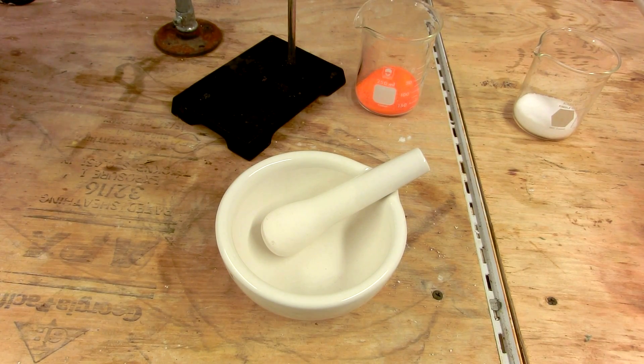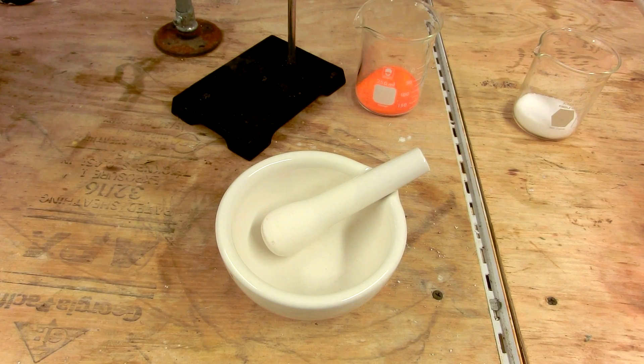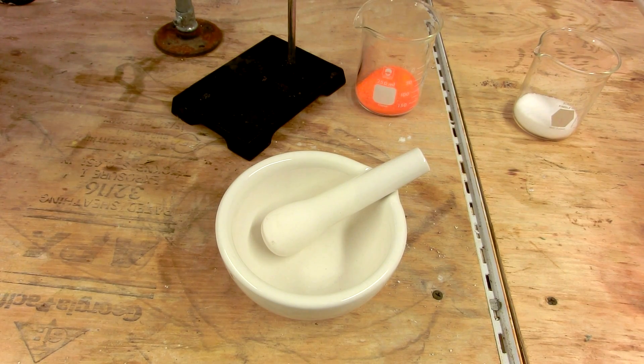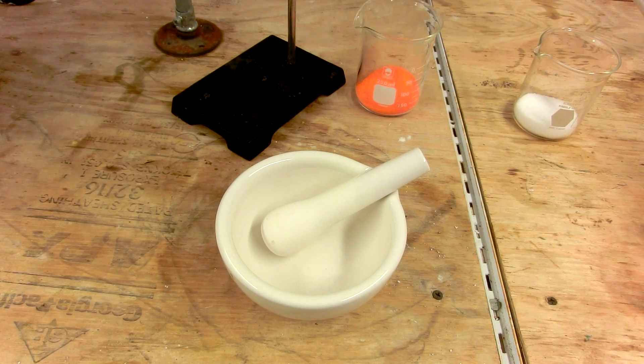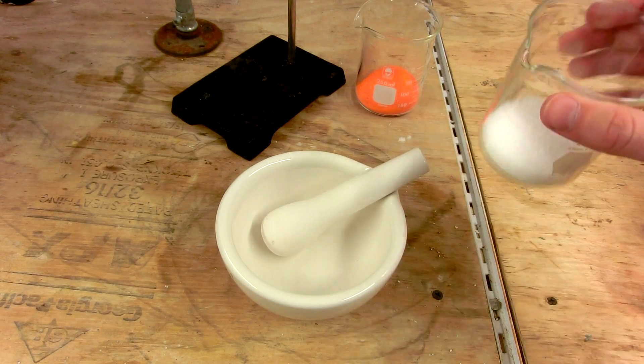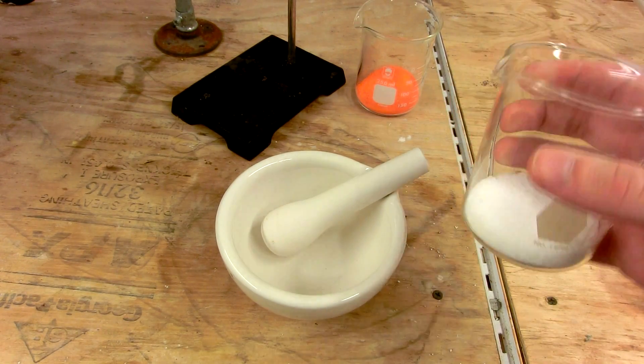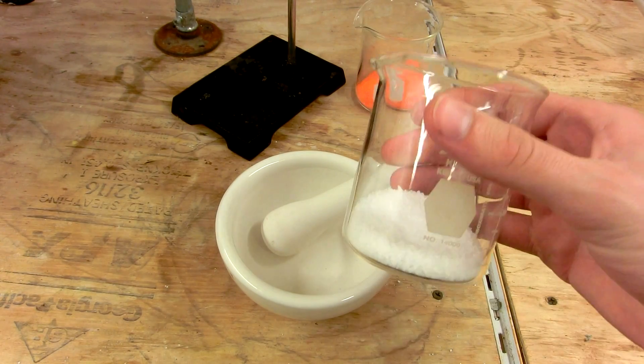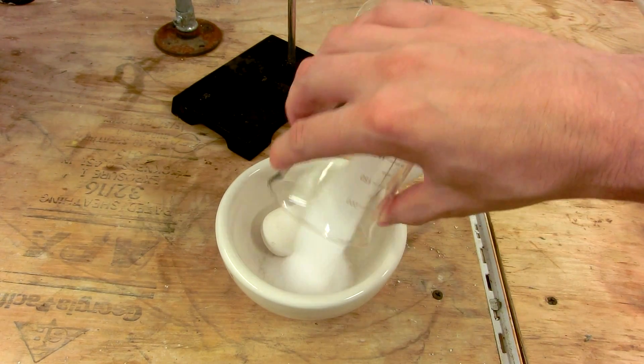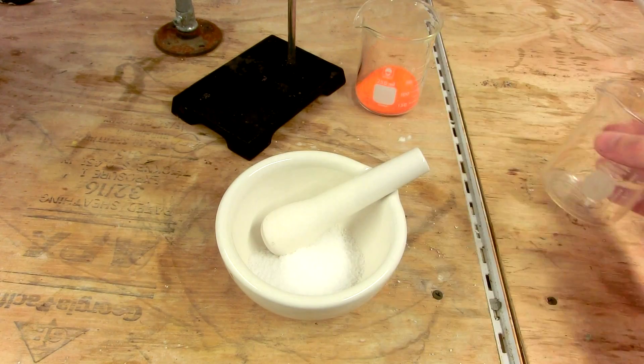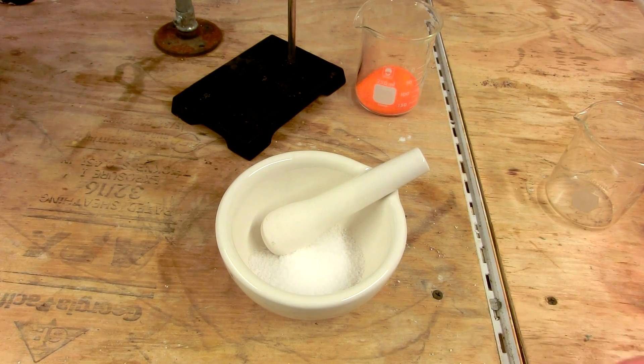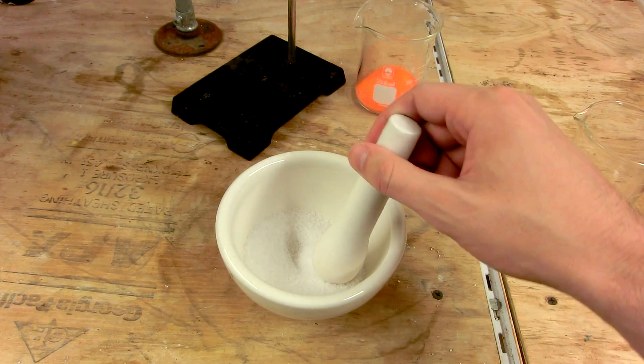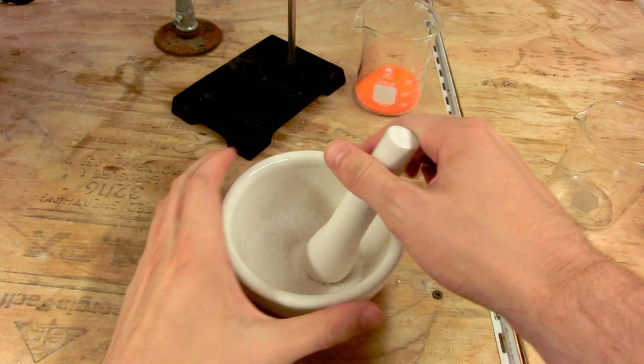Since this reaction requires equilibrium to be achieved before we begin to distill, we need to mix all of the reactants together as thoroughly as possible. So we're going to first measure out 46.75 grams of sodium chloride, non-iodized table salt, and grind it up into as fine a powder as we possibly can. I'm running this on a 1/5th molar scale based on the equation you saw earlier.